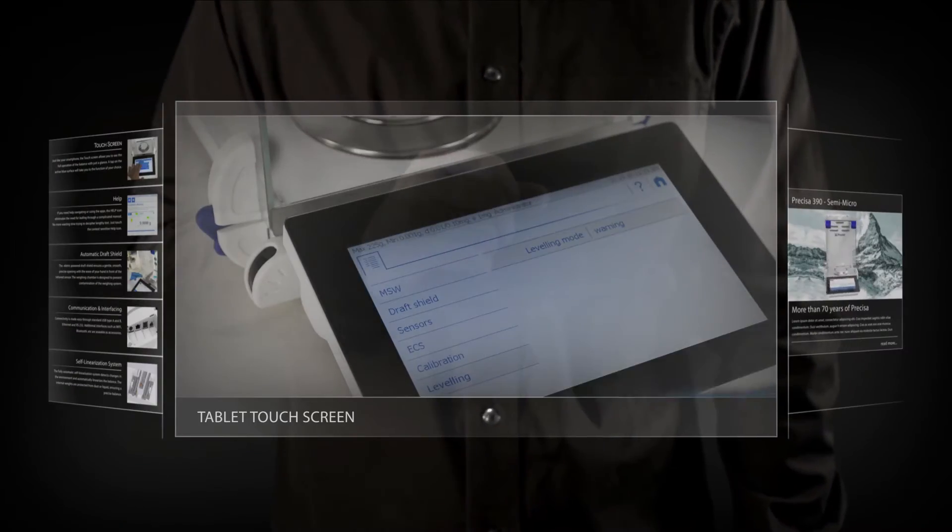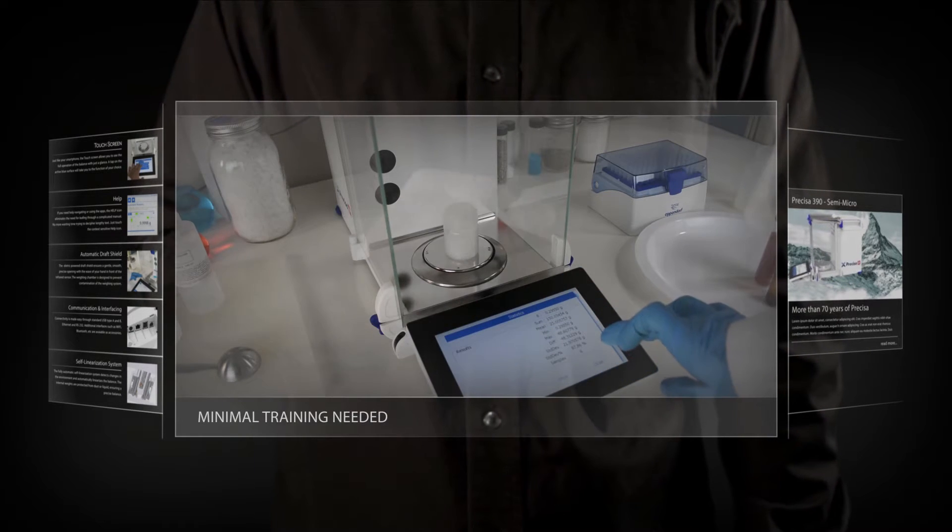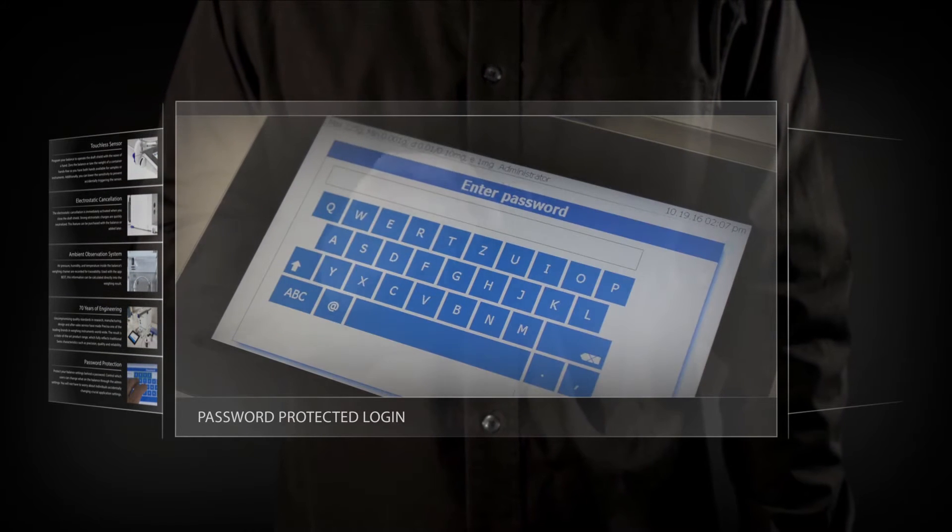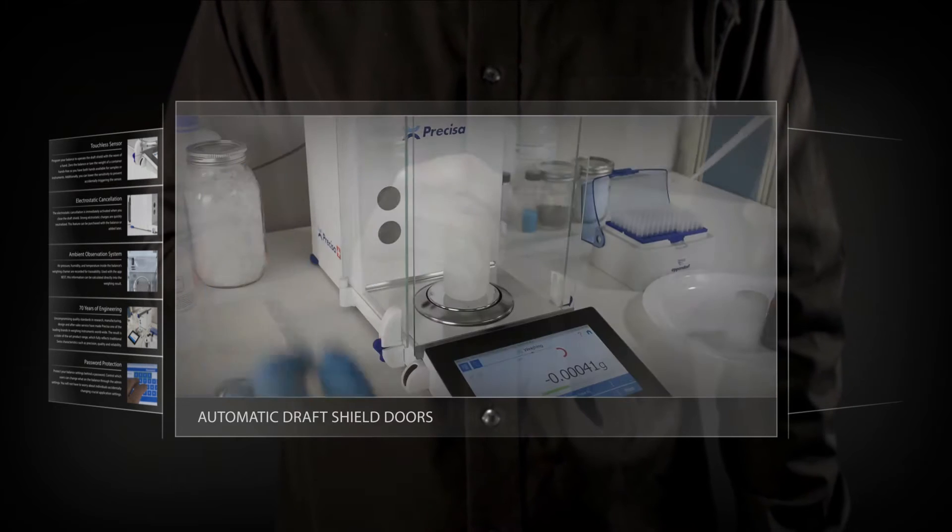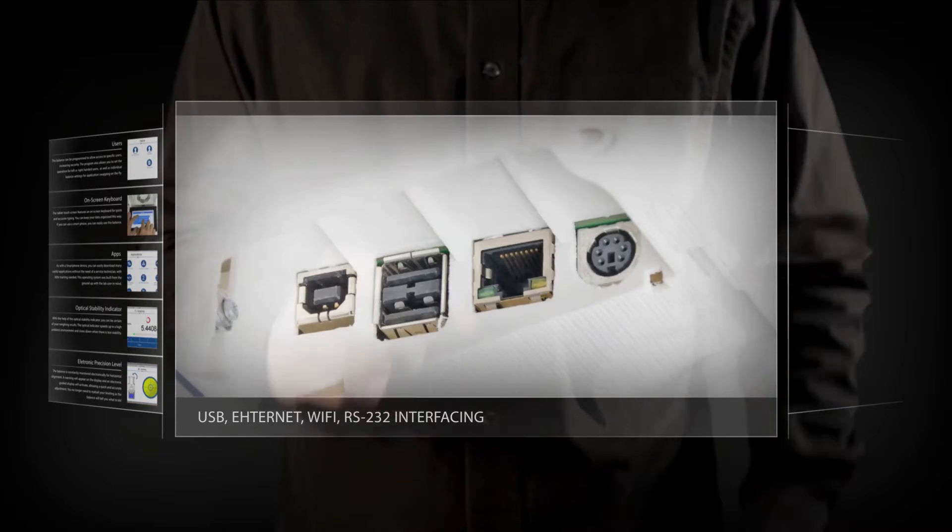What if we made a balance that monitors itself so you would be confident that you're getting the most consistent and verifiable results? And what if we made a balance so easy to use you would never have to read the manual? Well, we did.